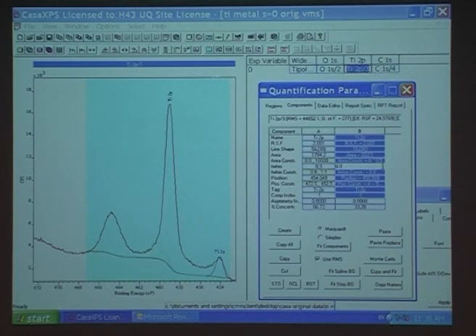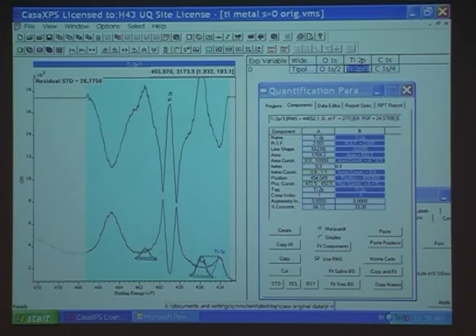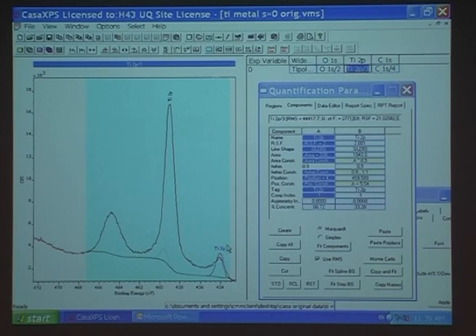Now I've got these two peaks locked together. They call it an ensemble. So now when I move one, the other one will move. Keep the same distance. You watch when I move this one. The other one will follow. See that? Now I needed to do that because this is made up of 3 or 4 more sets of 2. This is really complex fitting. There's another big one there for the TiO2. Okay, I might put those in now.